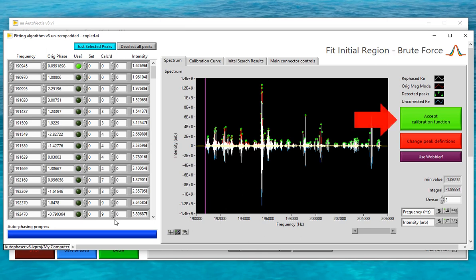In most cases all you'll have to do is click the accept calibration function button. Before I do, I'll explain what will happen next. The phase correction function generated by this brute force fitting method is only an estimate of the true phase correction function in this region. So Autovectus uses a genetic algorithm based optimization method to tune the phase correction function. The process goes from this initial fit to a complete phase correction function across the whole spectrum: optimize this brute force fit on a small region, then extend out to a slightly wider region and re-optimize, and Autovectus will automatically repeat this process over ever larger regions until the whole spectrum can be phased.